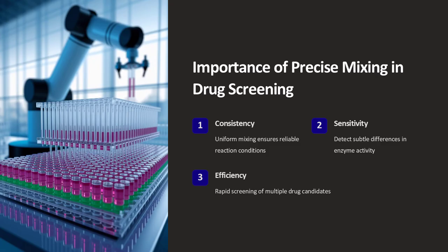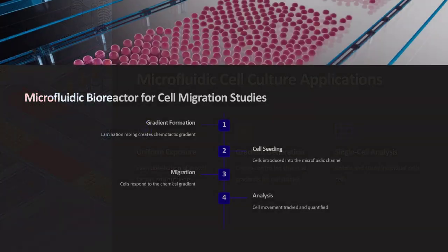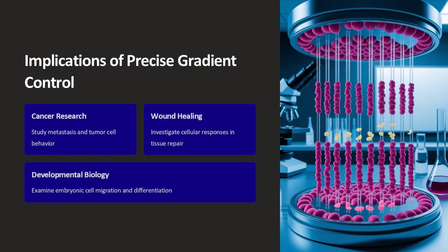Unlike passive methods, active mixing employs external forces to promote fluid agitation. Examples include using magnetic fields, acoustic waves, or electric fields to perturb the fluid motion within the channels. For instance, magnetic stirring can be achieved by embedding magnetic nanoparticles within a fluid and then applying an oscillating magnetic field. This approach is akin to using a handheld whisk in a bowl of batter, except that in a microfluidic channel, the energy can be delivered with pinpoint precision and without physical contact.